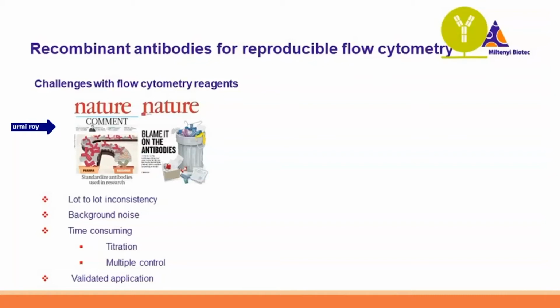Some of the commonly debated challenges are lot-to-lot variation, the background noise that arises from antibodies, and also titration and control-related issues, and sometimes also applications that are not properly validated.